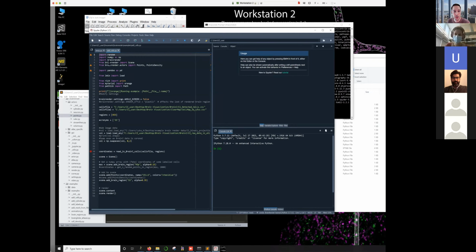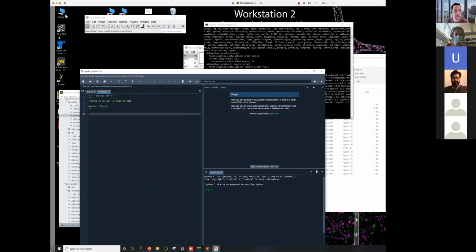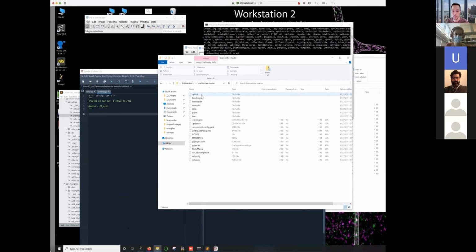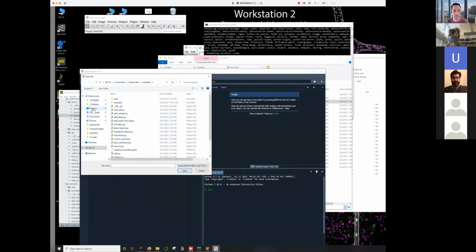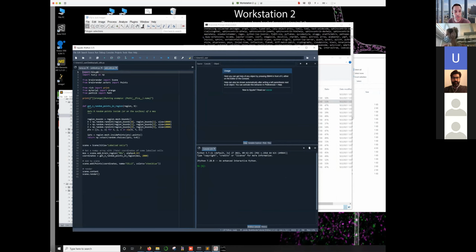We're basically importing BrainRender, and we're importing the scene and points tool. Actually, maybe this has been a little bit edited on my side, so that can be a little bit confusing for you guys. Let me just get rid of that. That's better.